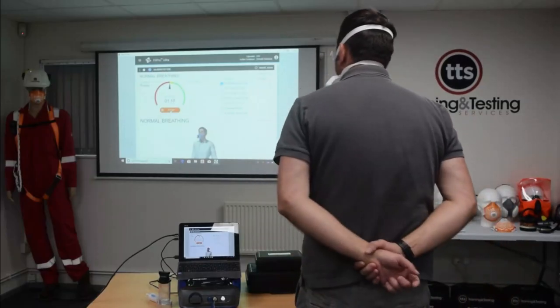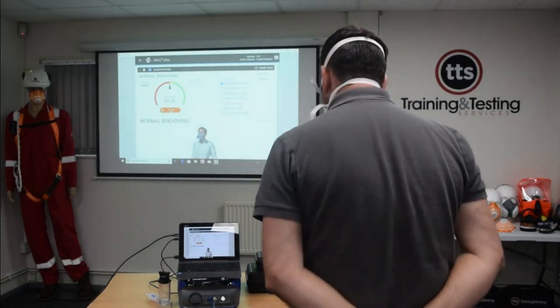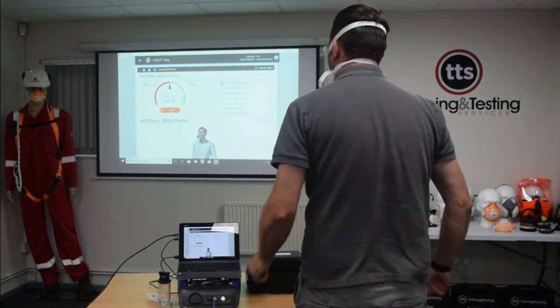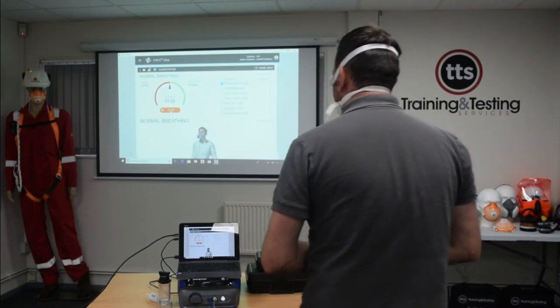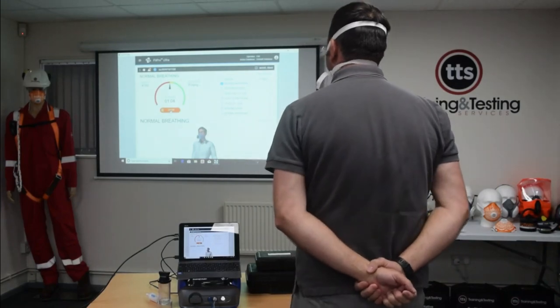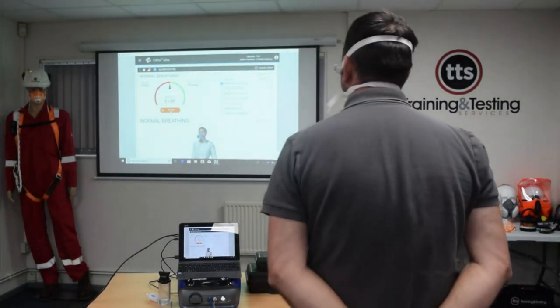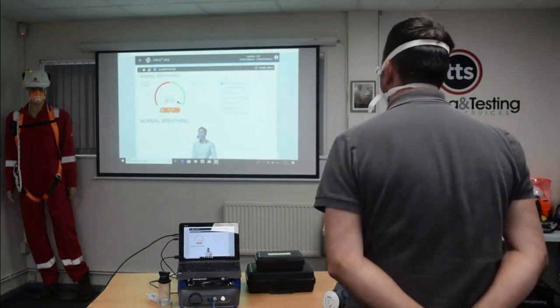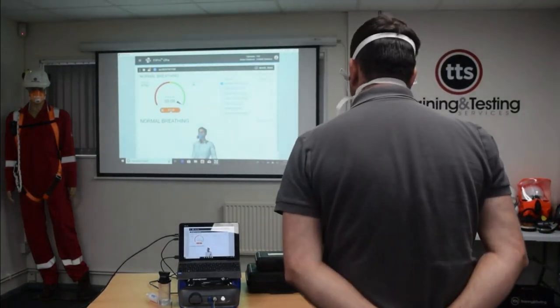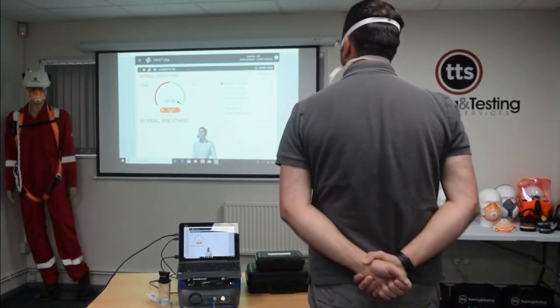So, I've pressed start on the machine. The first exercise that I've got to do is normal breathing. At the same time, I'm stepping up and down on an aerobic step, okay? What should happen is when the countdown clock gets to 1 minute, we want the arrow to go into the green and not the red. Green is a pass, red is a fail. The next exercise, when the machine beeps, we'll be switching to deep breathing while maintaining the steps on the aerobic step.